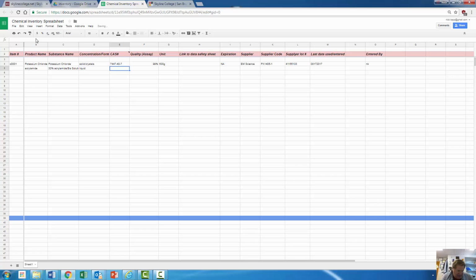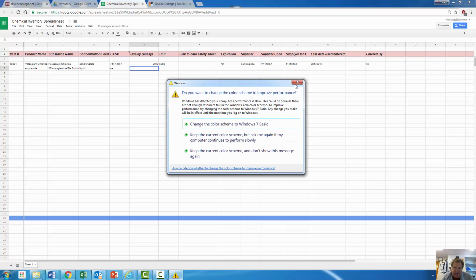The CAS number, there's not one on here, so say NA if you can't find one. Quality assay is 100%.